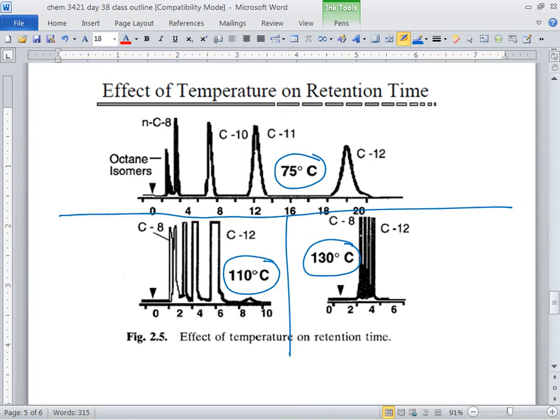And this is where things are kind of odd. I mean, it just takes getting used to. How something with 12 carbons is very different than something with 8 carbons. And this idea of the degree of being organic, or some solvents are more organic than others, that whole type of talk is just something that you can only get used to by injecting samples and seeing their effect. But the C12 is extremely organic, is the words that they would say, because the stationary phase is probably this big, long chain, maybe something like, and we'll talk, well, pictures of them, but much more organic than C12 even.